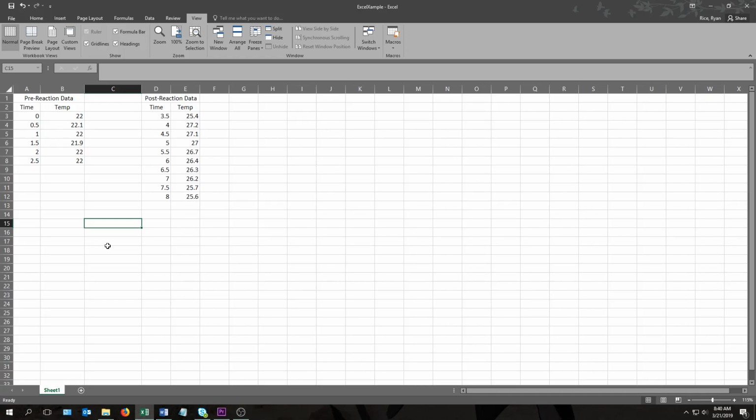Hello everyone, this is Ryan Rice from Washington State University, and in this video I'm going to cover how to make and use the graphs you'll need for the enthalpy of formation experiment. I'm going to do this on a PC running the 2016 version of Excel. Your own version might be a little bit different, but the concepts will still be the same.